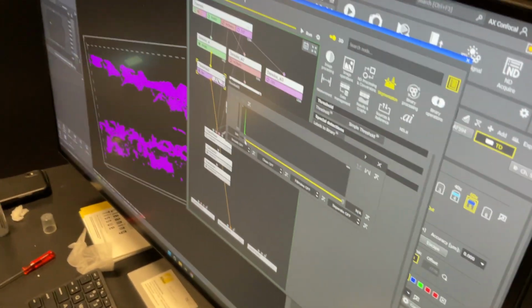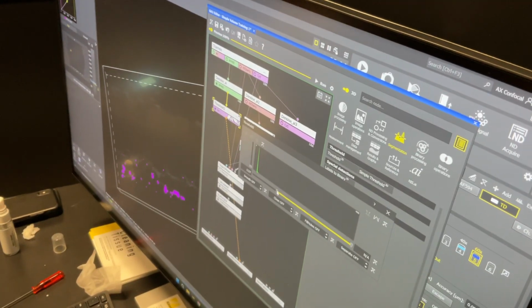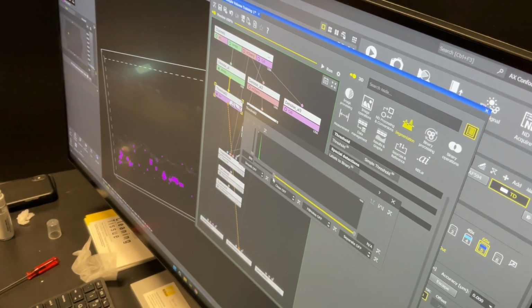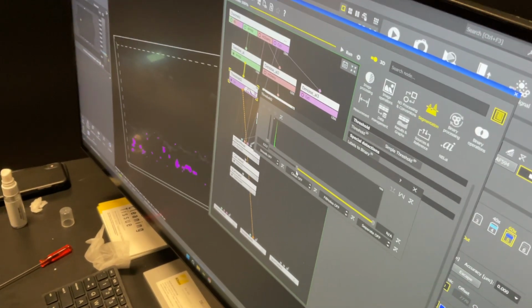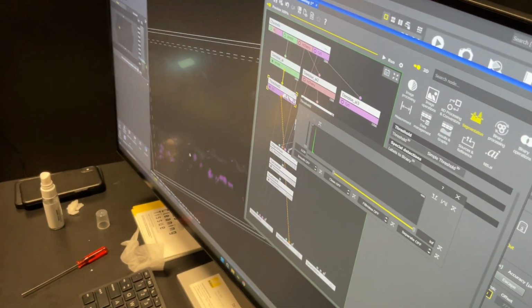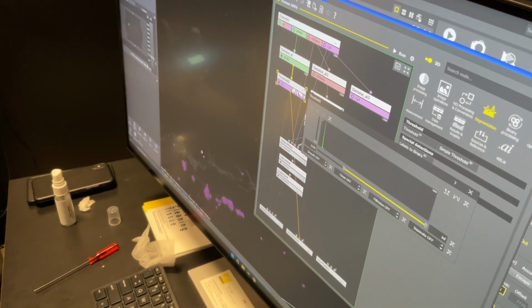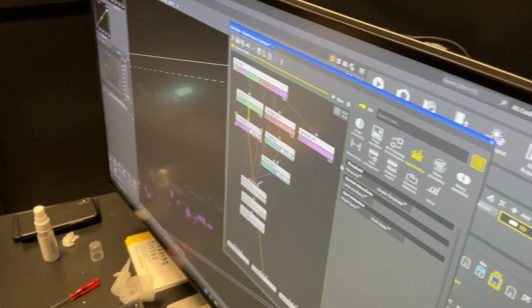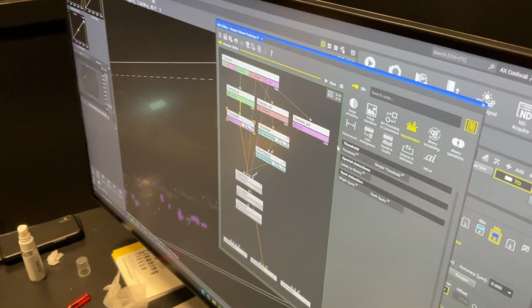And then I'm going to go in and do the same thing. Rinse and repeat. The green is very bright, so there's a lot of background. That looks pretty good. So here again, you can do those extra filtering steps if you wanted to. You can filter by intensity if you wanted to. Like, oh, these are really bright.